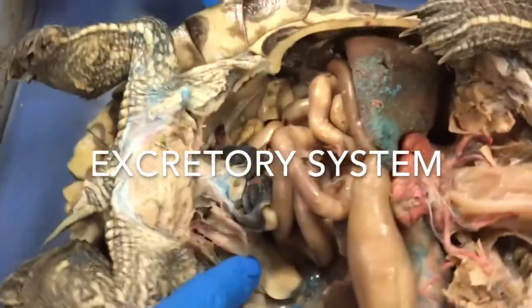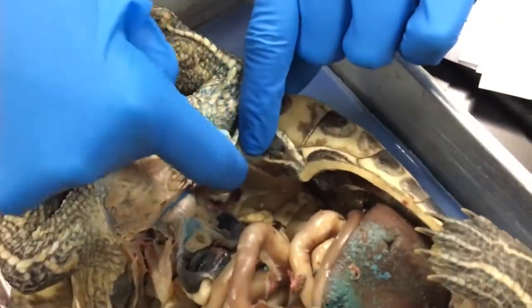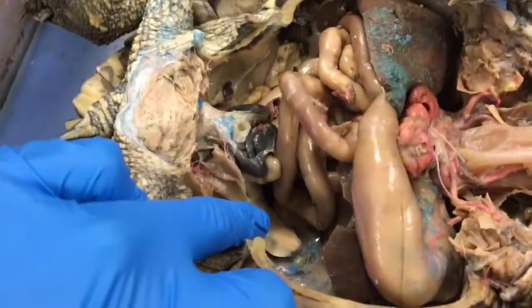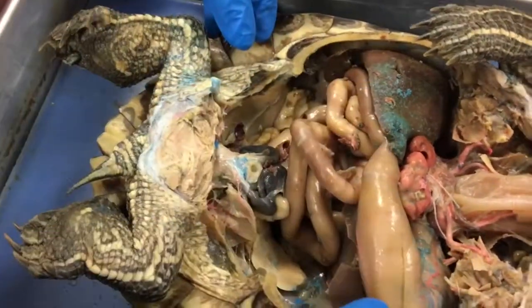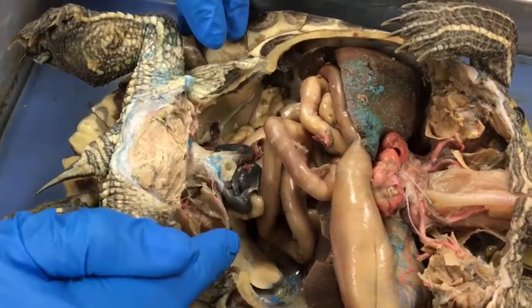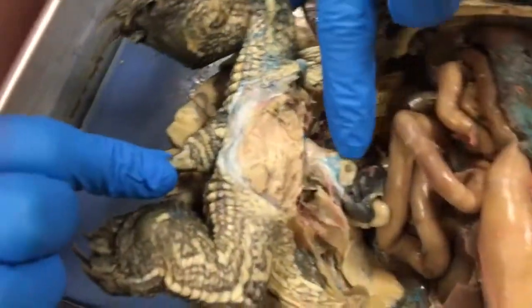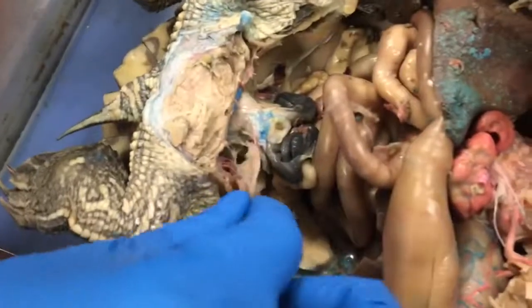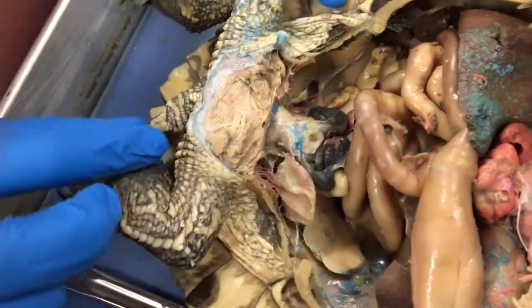The metanephric kidney is the turtle's main organ of the excretory system. Turtles have paired kidneys, which remove their wastes. Renal arteries and veins transport blood to the kidneys, which then remove water and nitrogenous wastes from the blood. Water is often pumped back into the body while the nitrogenous wastes are concentrated into uric acid, which is then removed through the cloaca. The waste is stored in the urinary bladder until it's ready to be excreted through the cloaca.